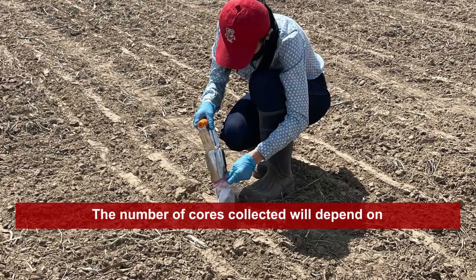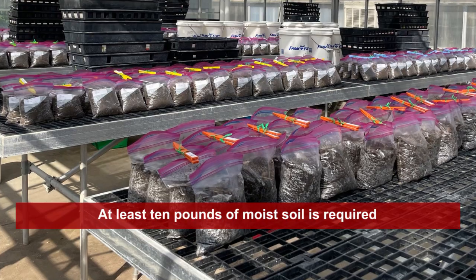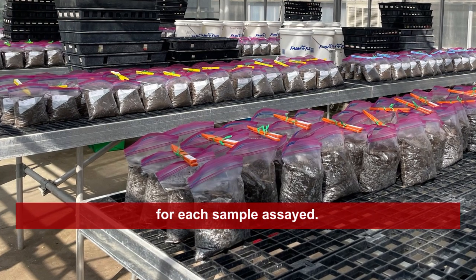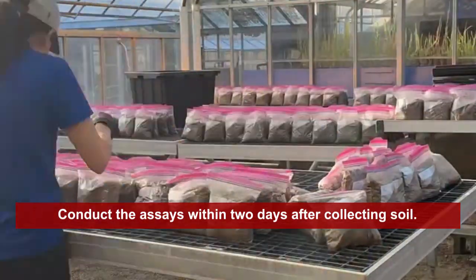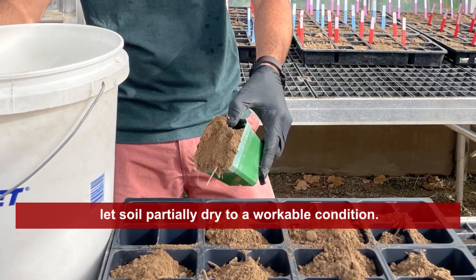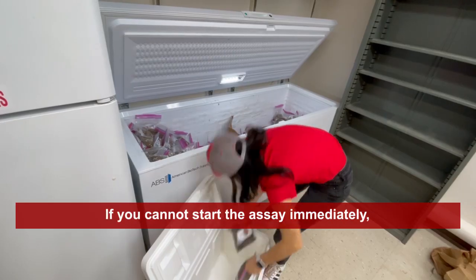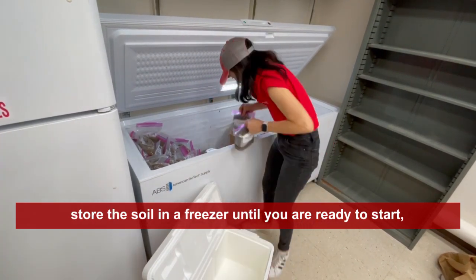The number of cores collected will depend on your soil sample dimensions. At least 10 pounds of moist soil is required for each sample assayed. Conduct the assays within two days after collecting soil. If the soil samples are too wet, let the soil partially dry to a workable condition. If you cannot start the assay immediately, store the soil in a freezer until you are ready to start.